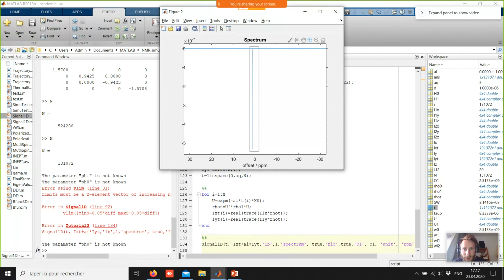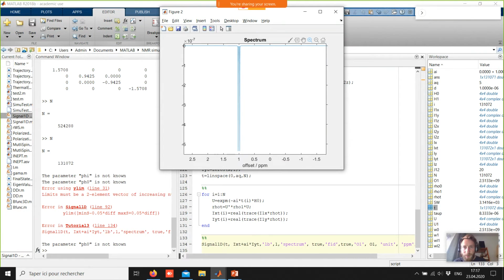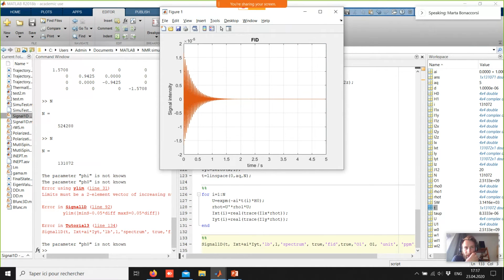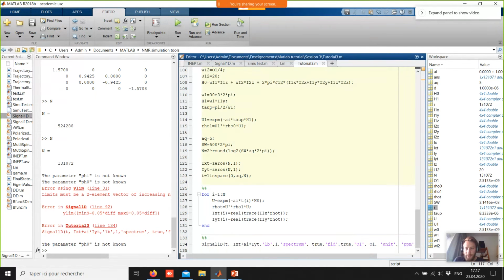Now you're going to say that I'm... Oh yeah. Oh yes, you are completely right. Maybe if you want, I can run again. Let's make it a bit shorter. 3 seconds, and like this will be faster.